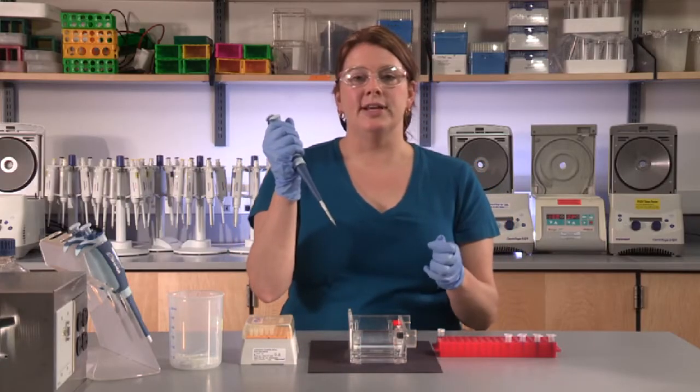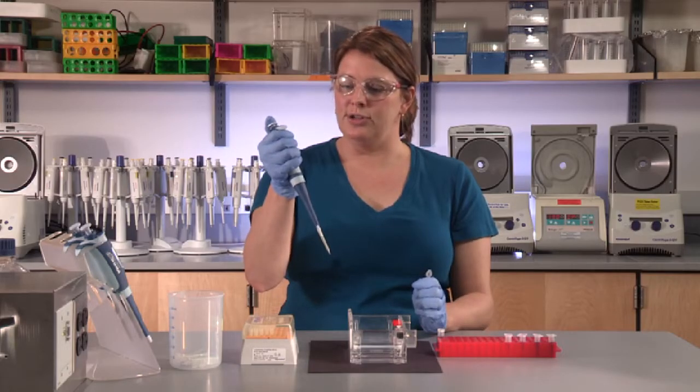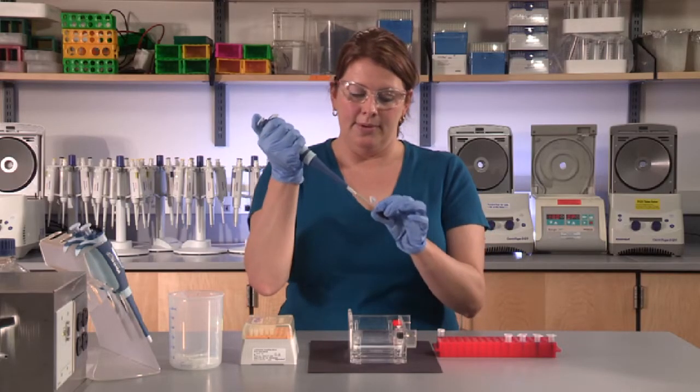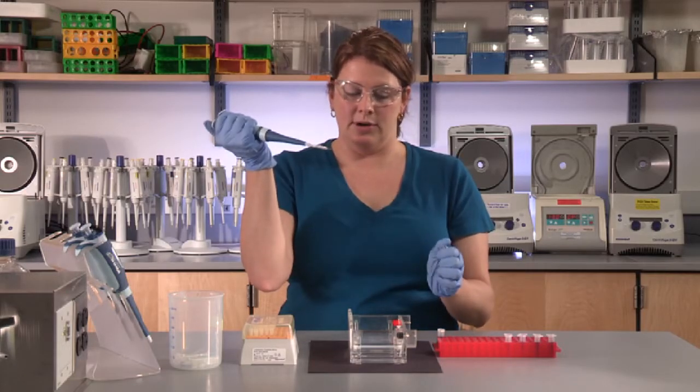Pick up the first sample that you'd like to load, using your thumb to press the plunger to the first stop. Let go of the plunger to draw up the sample that's to be loaded on the gel.